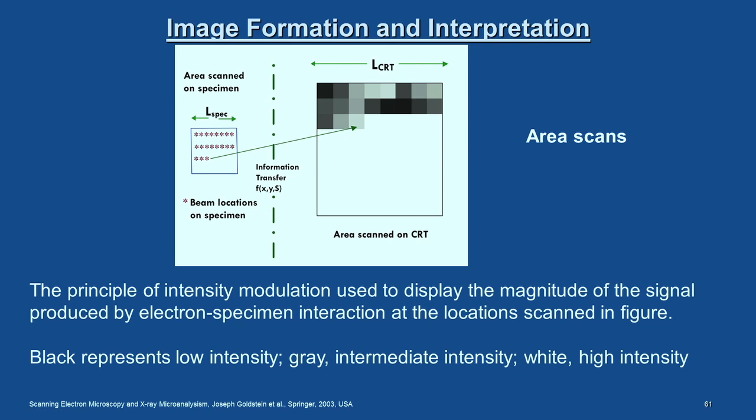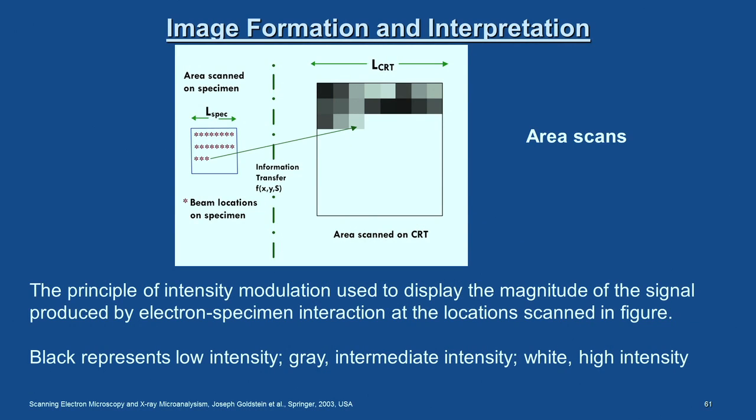Another important point to remember in SEM is that the image generation operation consists of signal mapping.